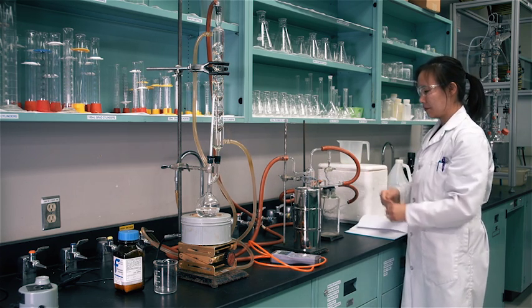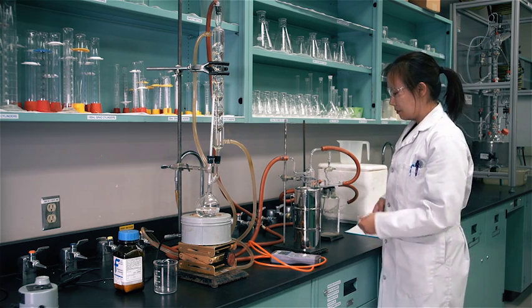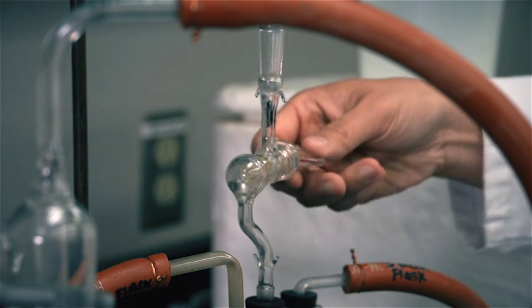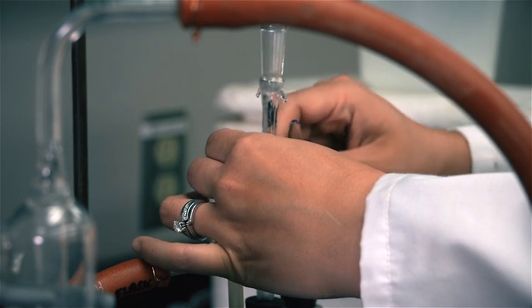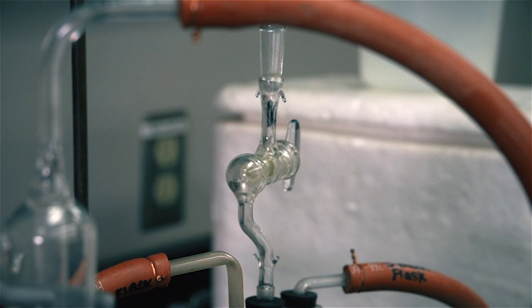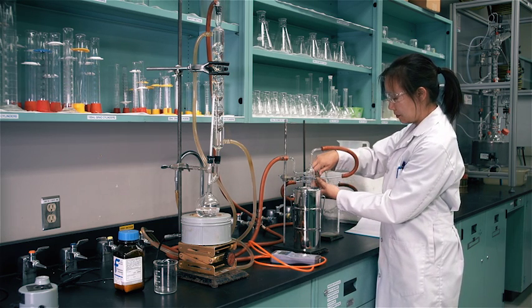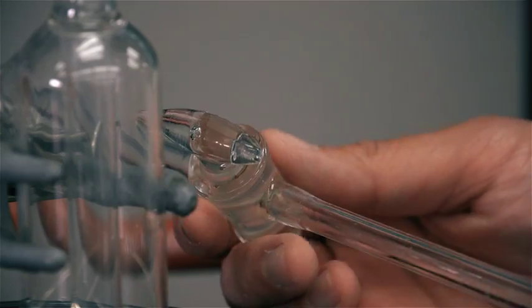One stopcock is situated on the safety bottle. Air will enter the experimental system when this stopcock is open. Along with the safety bottle, this stopcock is a safety feature of the experimental setup. The other stopcock is situated on the tubing adjacent to the safety bottle.